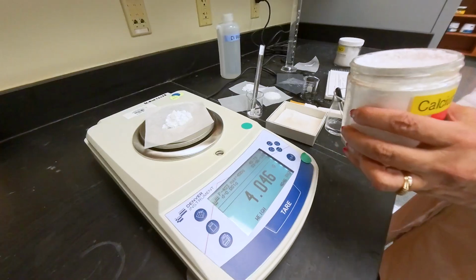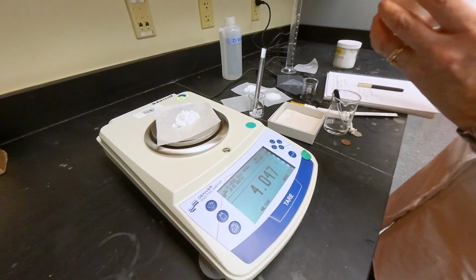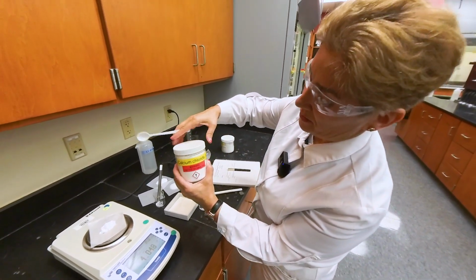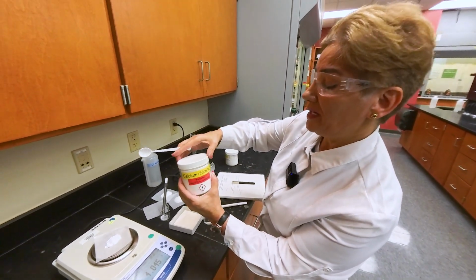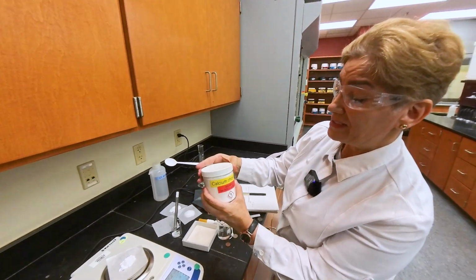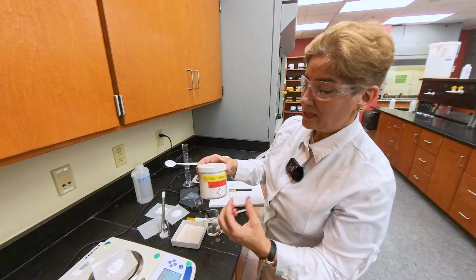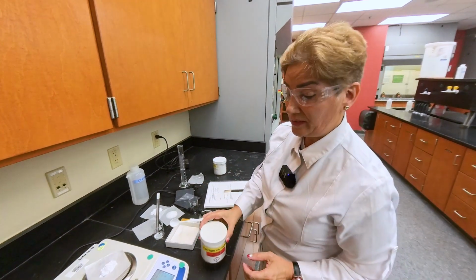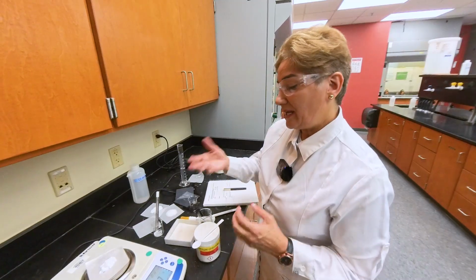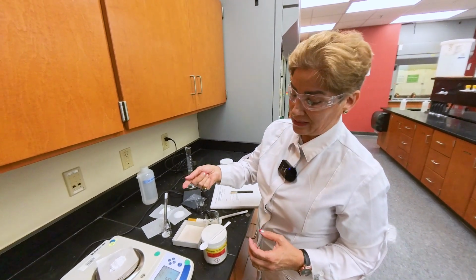Okay. This is calcium chloride anhydrous. What it means is that it has lost water, or there is no water. It's very good at absorbing water. It gets hydrated, so it absorbs the moisture from the air. So if we leave it out for 15 minutes, as it sits in the air, it's going to absorb water. The mass is going to increase.